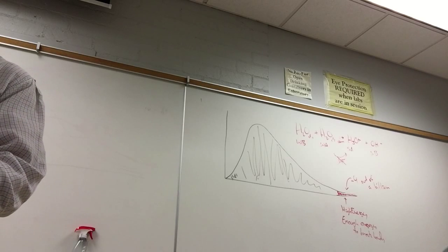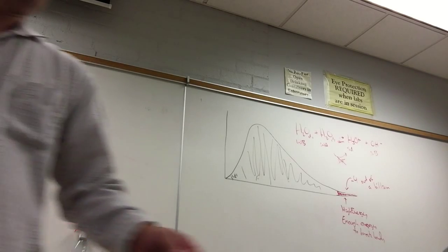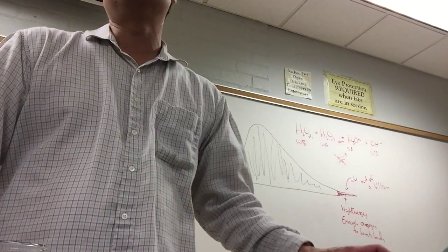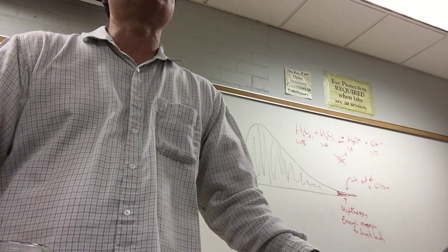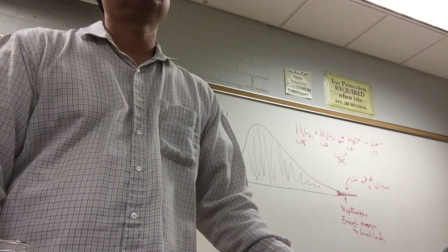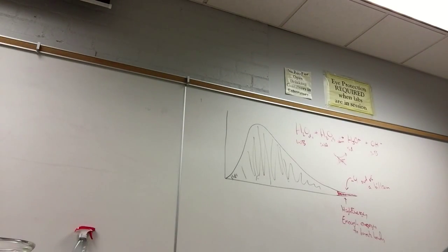Sodium chloride is pretty weak because did it light up the bulbs? No. But when I was looking at it in the original, it was a strong electrolyte because it really lit up the bulbs, but it's the same thing. It's salt water. Same thing, right? And so our two definitions, one is, again, electrical conductivity. The other is dissociation or hydrolysis.